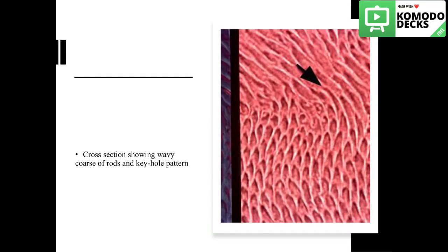We also mentioned in the lecture that enamel rods take a wavy or undulating course because the ameloblasts take this path while secreting the enamel. It's more obvious when we track the rods.